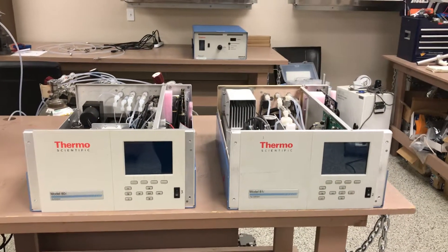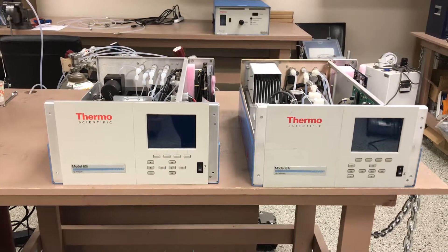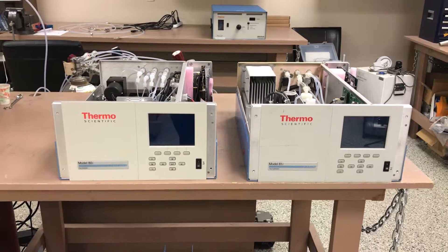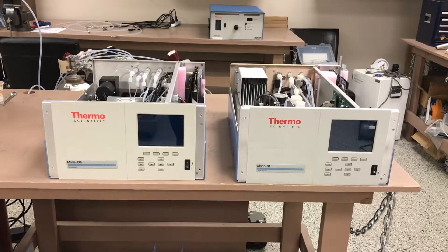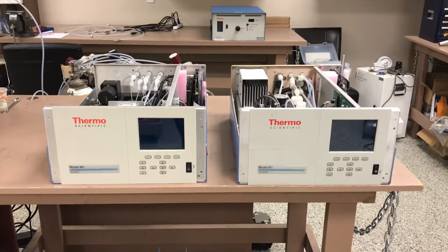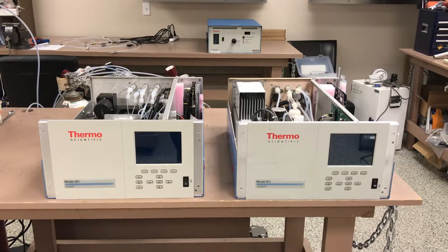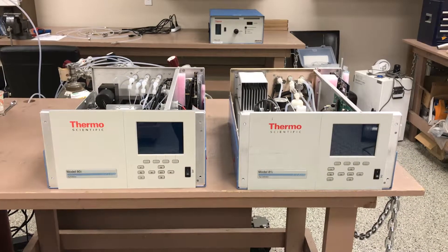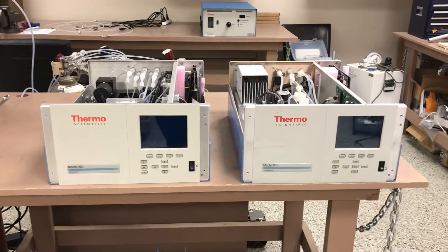Hi everyone, Jim with CDNOVA again. Today we're looking at the Thermo Scientific models 80i Mercury Analyzer and the 81i Mercury Calibrator. These are part of the Thermo Mercury Freedom System for SEMS monitoring, mostly at coal-fired power plants. Here in Alberta, we have quite a few coal-fired power generating stations, and all of these have some sort of mercury monitoring system. The majority of them have a Mercury Freedom, just like these two instruments here. There's a probe on the stack with an umbilical coming down to a shelter, and these instruments sit in a rack inside the shelter and monitor mercury 24/7.